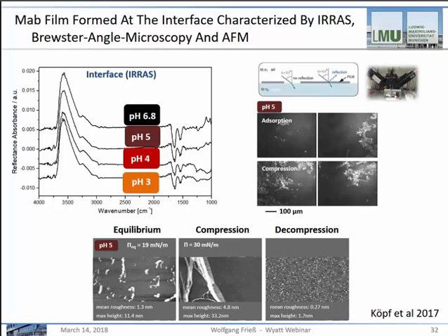We see these clusters of protein, and this is all within a film, so you could even compare it to the Arctic Sea, where you may have some ice shields floating on a different ice shield, so it's all overlap within a protein film.